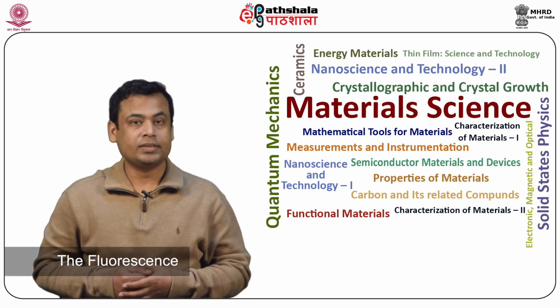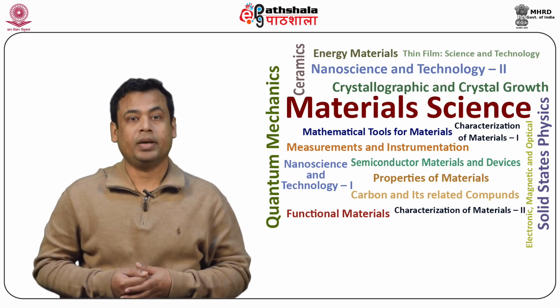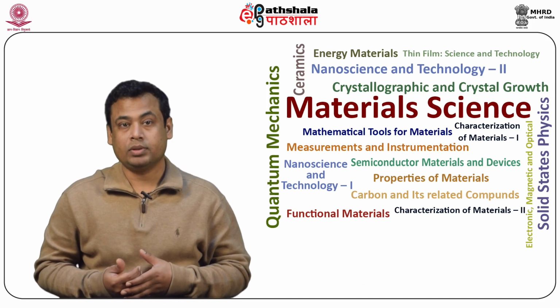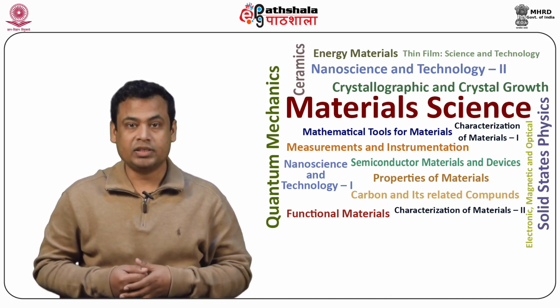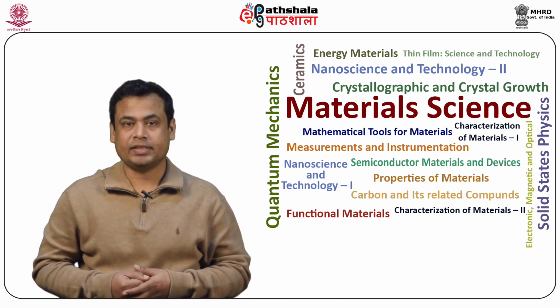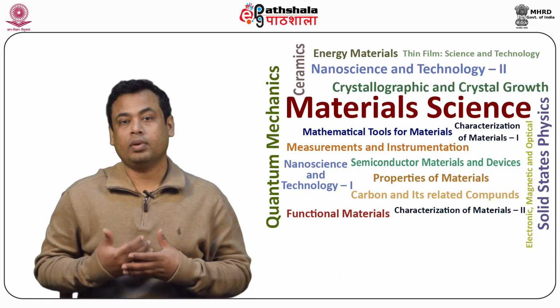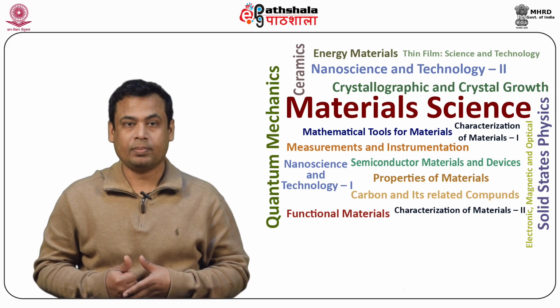The fluorescence of a material can be measured by fluorescence spectroscopy, which detects and records the amount of fluorescence light with high sensitivity. The devices that measure fluorescence are called fluorometers. Spectrofluorometric methods of analysis are among the most common analytical techniques.